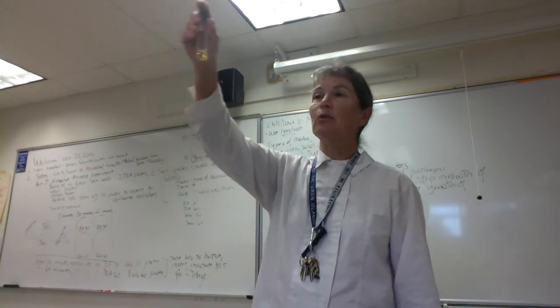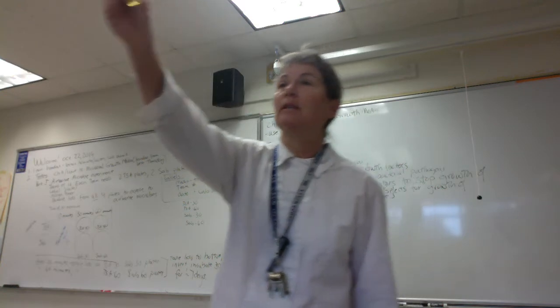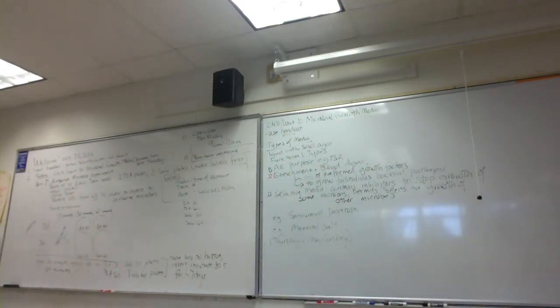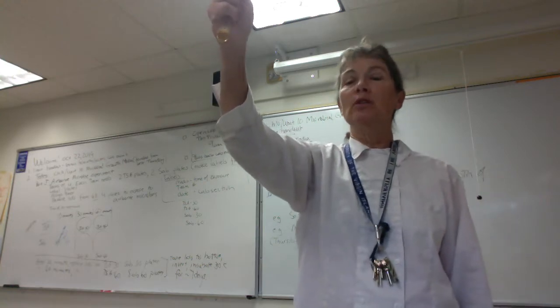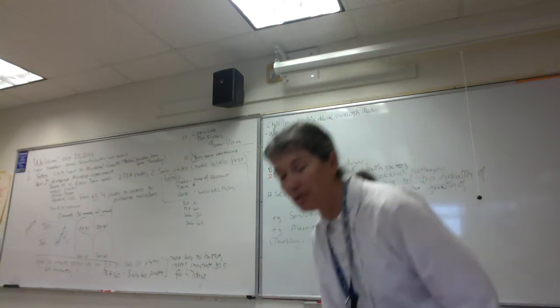Now, folks, if I told you that this broth had been autoclaved, so it should be sterile, just eyeballing it, do you think I'm right or am I pulling your leg? Does it look sterile? Yeah, you're right. I agree. And why did you make that conclusion? It's not too cloudy. That's right. It's not cloudy. It's transparent. So, folks, we use cloudiness, and the fancy term is turbidity, as a sign that cells are present.